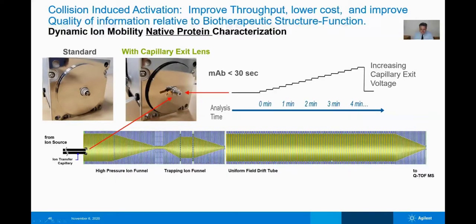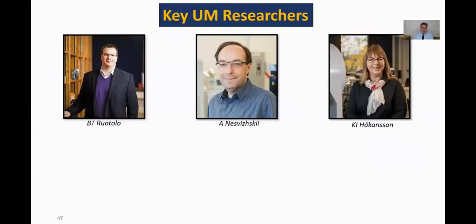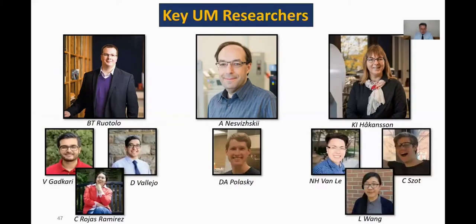We can step that potential over the course of the analysis. In this case, I'm showing a little bit of an extended time, but it can be also shorter. And as we increase that potential, we're increasing the activation energy that we're going to apply to protein systems. We've been working together with the University of Michigan and the great researchers there, with Brandon, Alexei, and Kiki and their teams, great graduate students and postdocs, and we'll look at some of the work that's resulted.